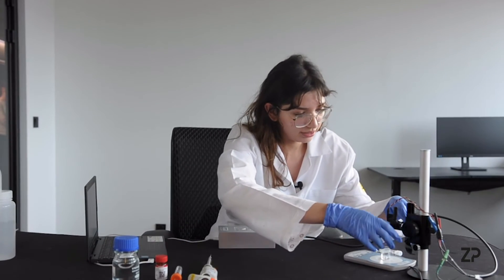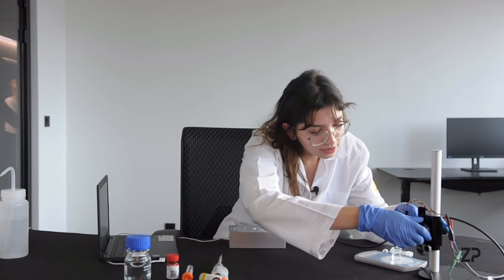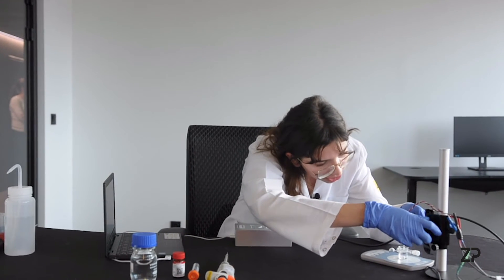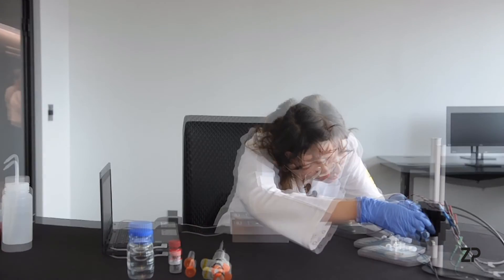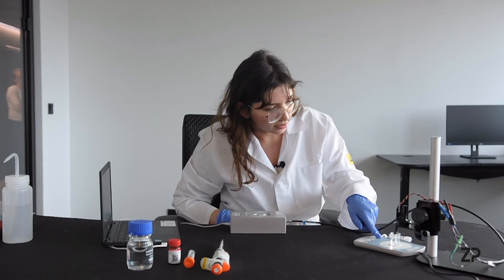Now that the software is all set up, it's time to submerge the lactate sensor into the PBS. I roll this down and it's important to have all three electrodes submerged into the PBS. All three are submerged and now we start the magnetic stirrer as well.